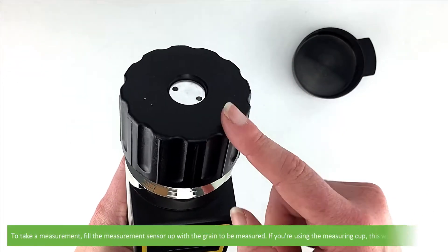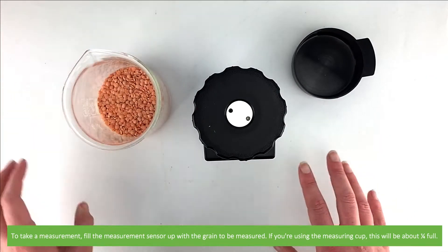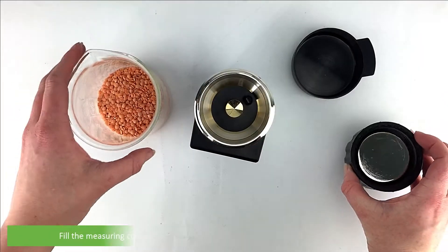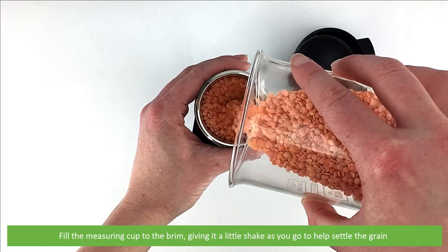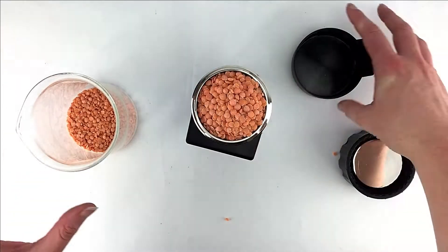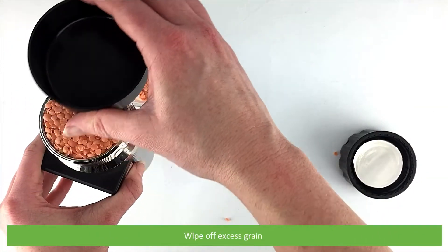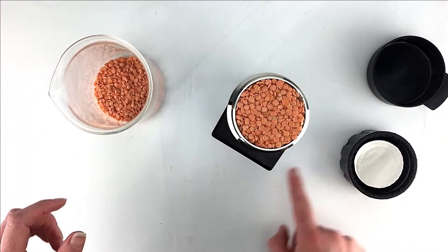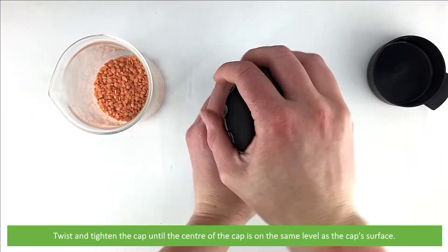To take a measurement, fill the measurement sensor up with the grain to be measured. If you are using the measuring cup, that's about a quarter full. Fill the measuring cup to the brim, giving it a little shake as you go to help settle the grain. Wipe off the excess grain, then twist and tighten the cap until the center of the cap is the same level as the cap surface.